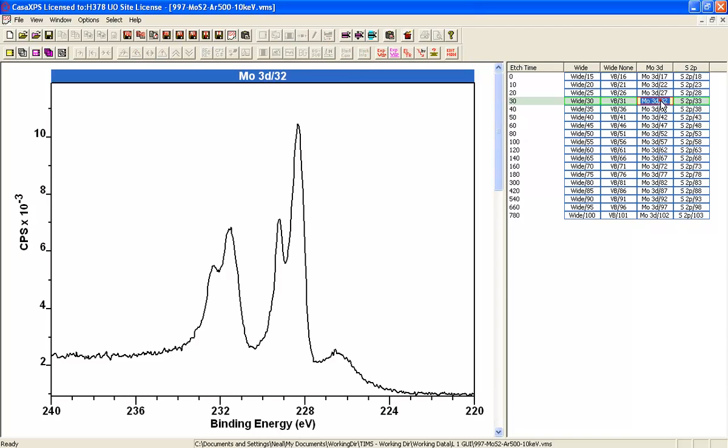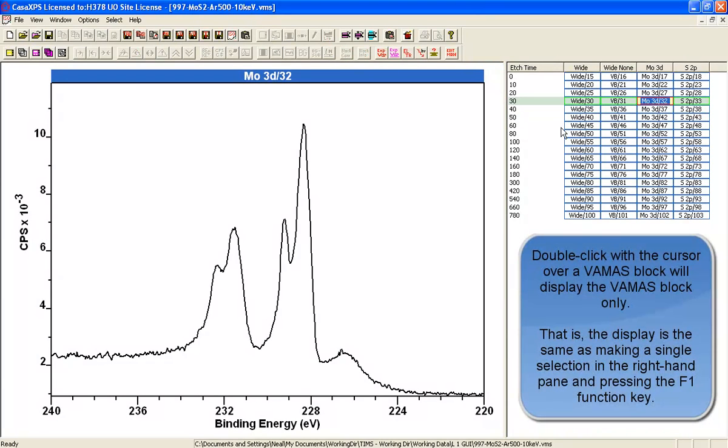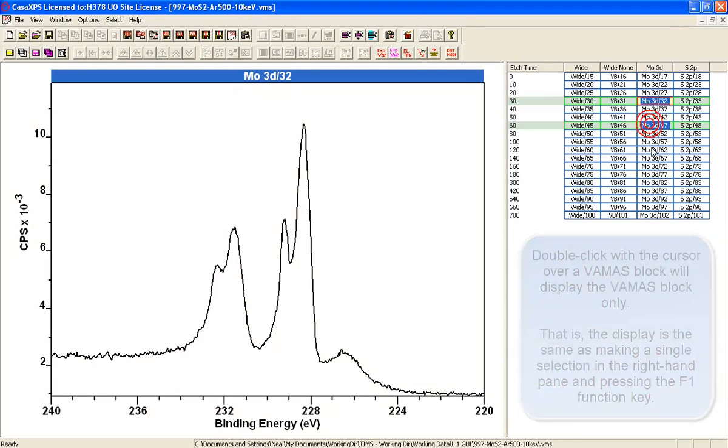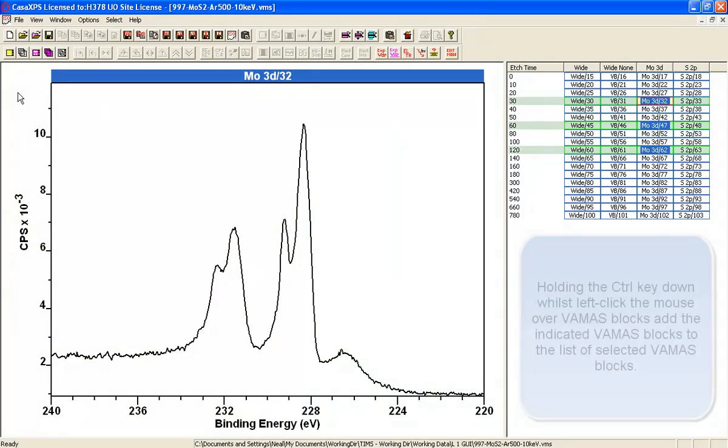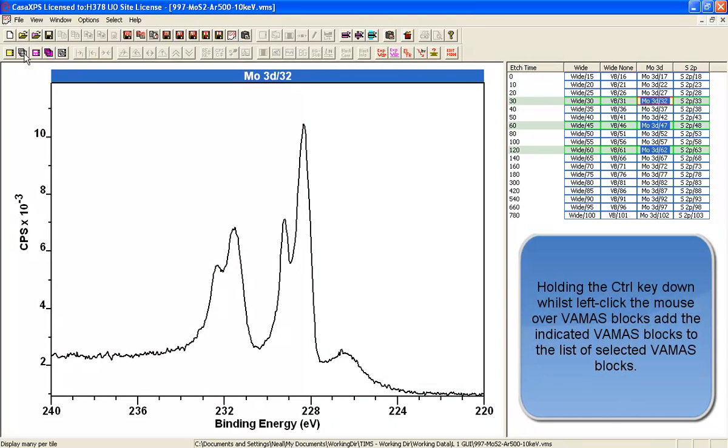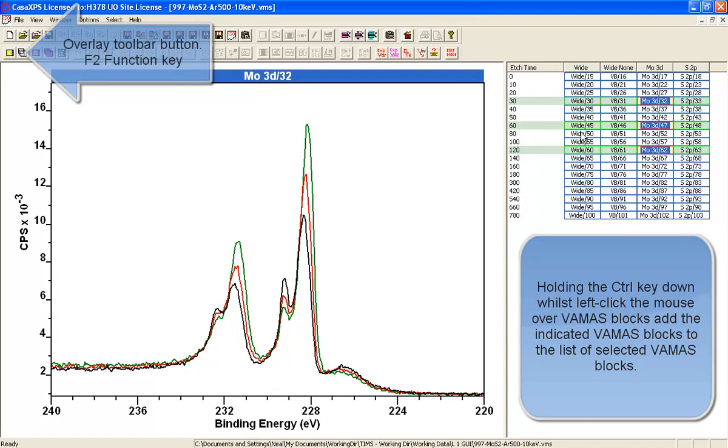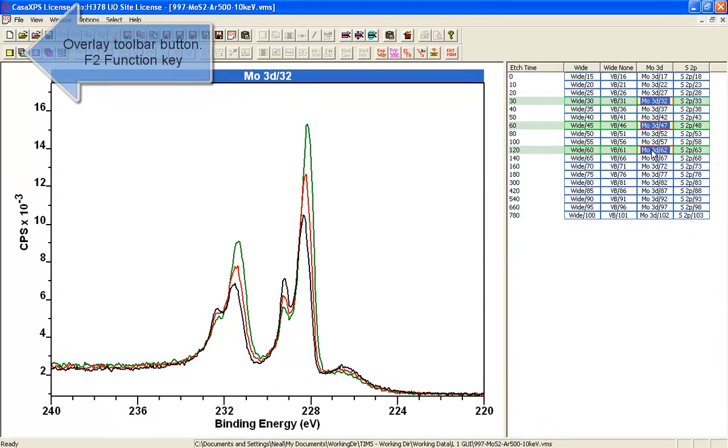Alternatively, if I double click on one of these, you can see that it now displays the one I've double clicked. I could make a selection holding the Control key down to add to the selection, then use the overlay to display the spectra that have been selected here on the right side.